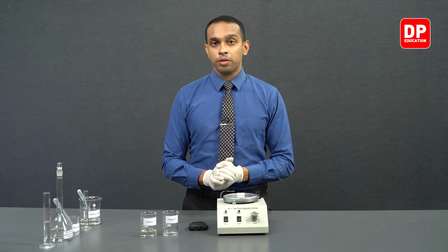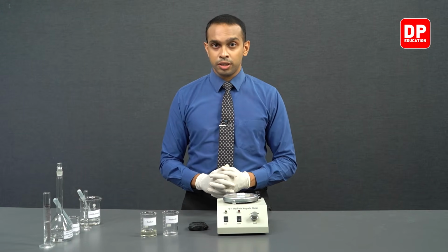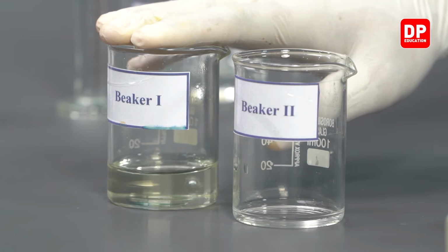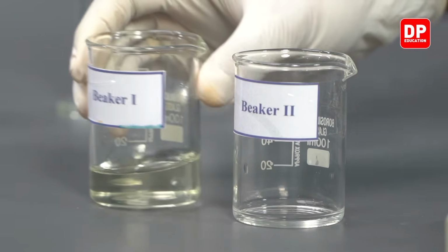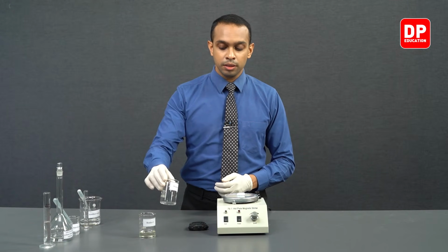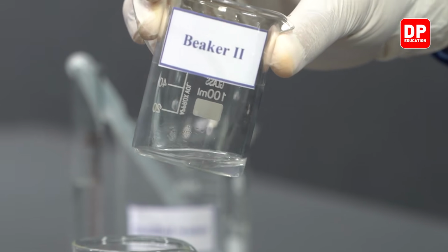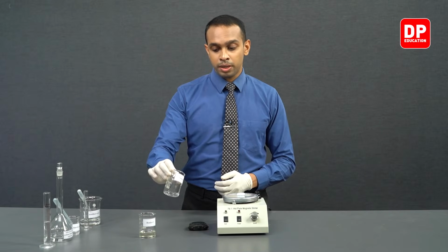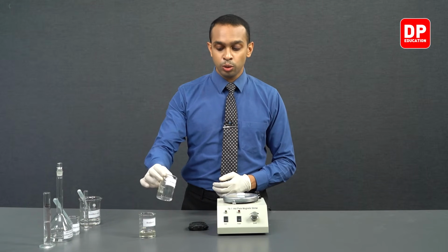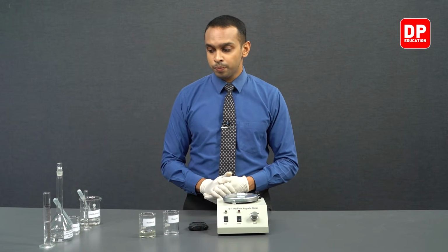Now students, we move on to the final reaction here, and in this reaction we have taken 25 cubic centimeters of acidified Fe3+ ion solution into beaker 1, and to beaker 2 we have only taken 2 cubic centimeters of potassium iodide solution. This potassium iodide solution has a concentration of 3 moles per decimeter cubed. We have taken only 2 milliliters of potassium iodide solution into beaker 2.